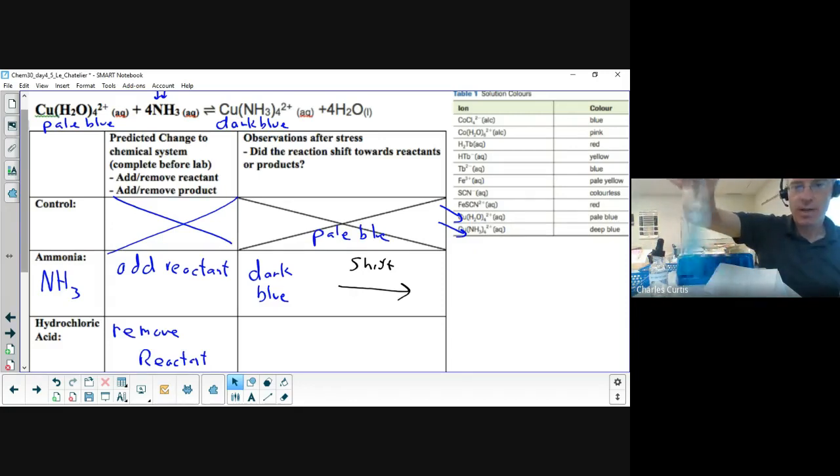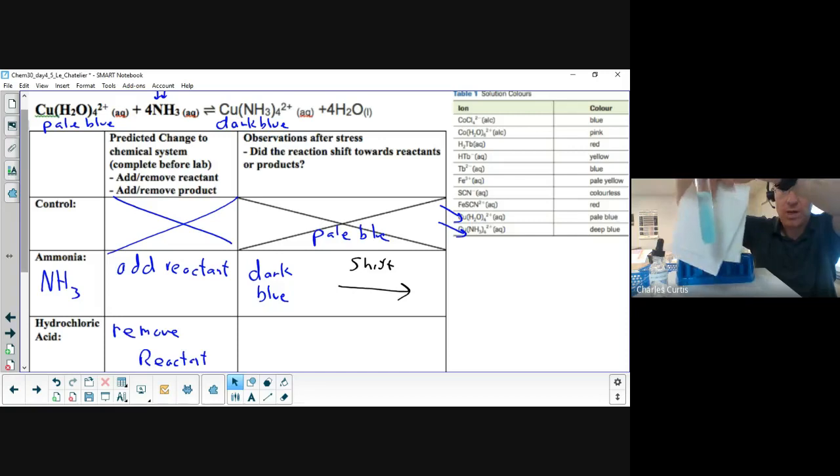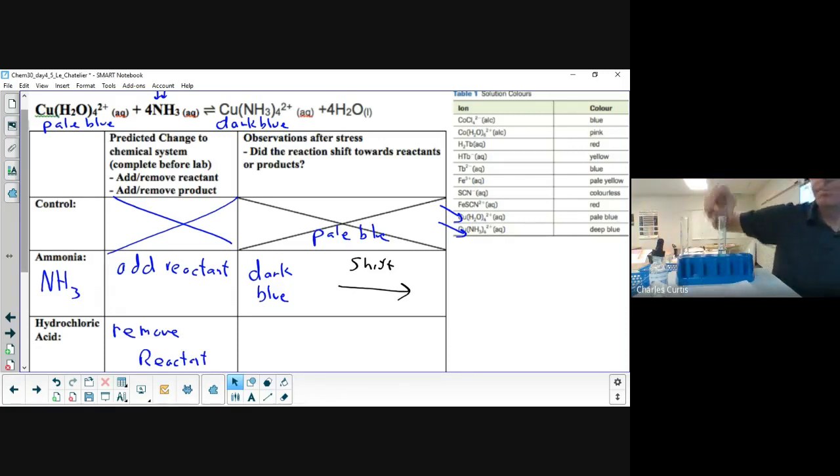Now, solutions don't mix well in these test tubes. They take good shaking. And yeah, that dark blue is definitely gone. And we have a nice light blue color again. Light blue is reactants.